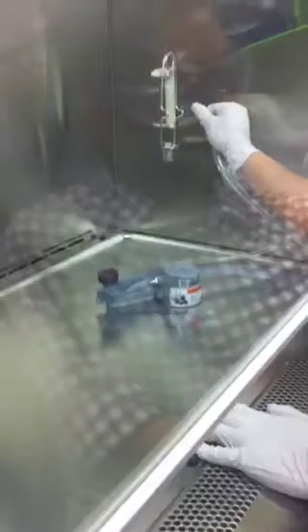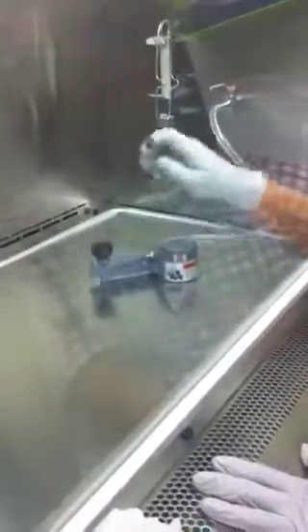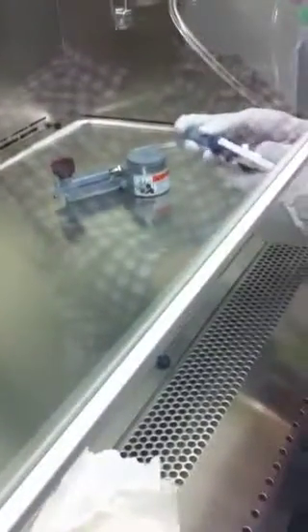Okay. So I'm applying the vacuum line. So now it has a suction over here. It's always a good idea to clean the vacuum line because it comes in contact with these cells, so you're not sure what's inside. So it's good to just wash the line, just to make sure the line is clean.